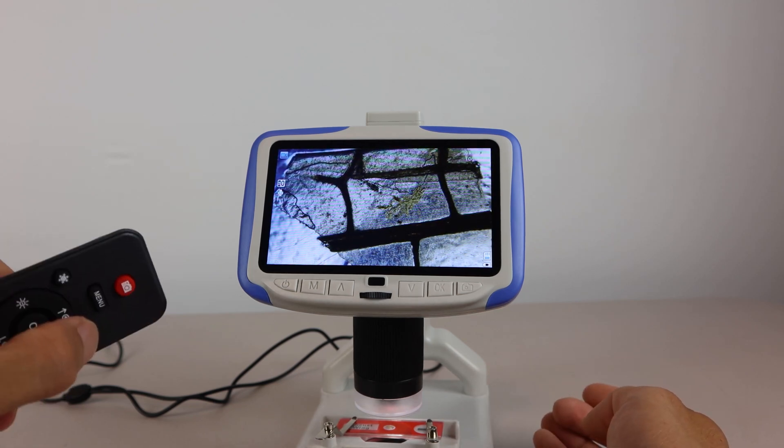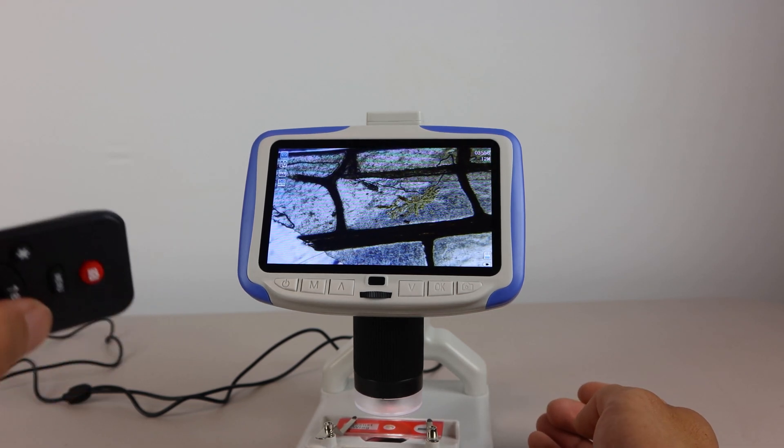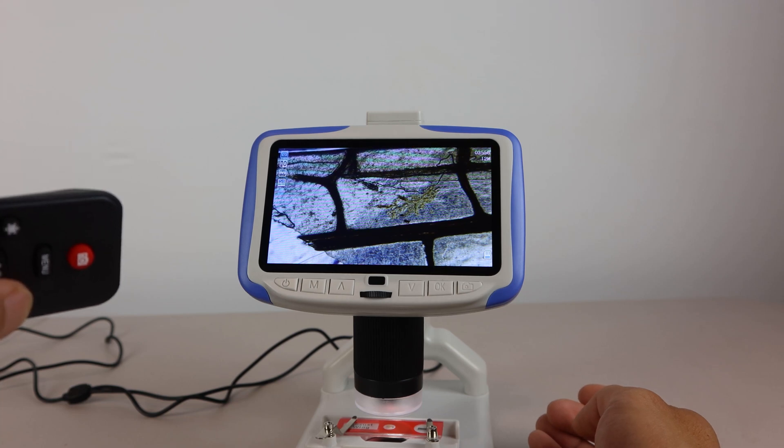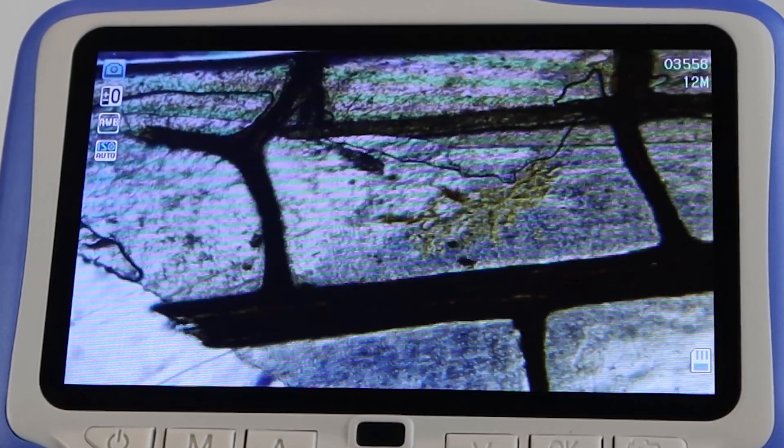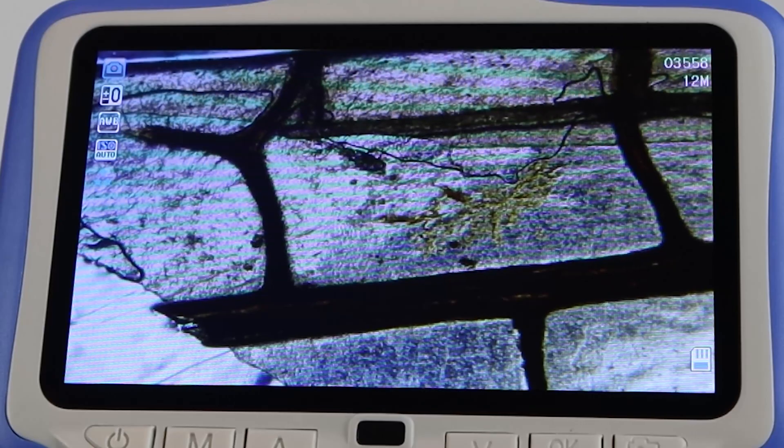When you change the mode to photo mode, the proportions are slightly different. But you can capture 12 megapixel still photos from the camera by pressing the OK button.